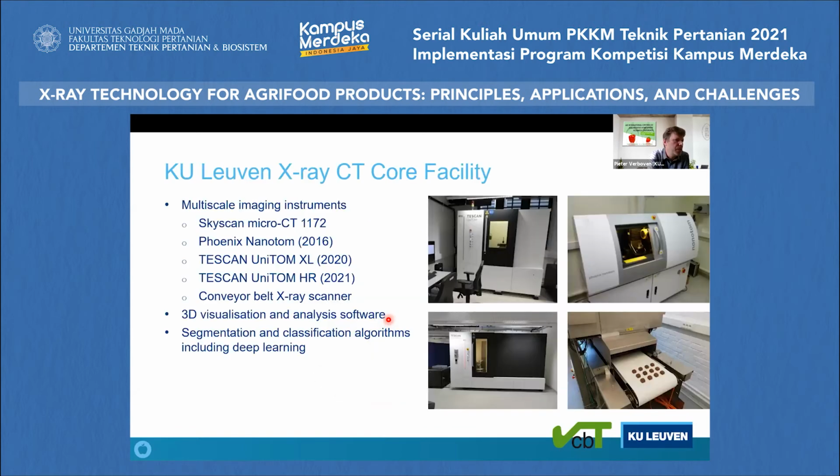Now at KU Leuven, we have invested a lot over the years into X-ray imaging because we see a lot of the benefits here. And because X-ray imaging is used in a lot of disciplines, not only in agri-food applications, together with other groups at the university we have invested into a core facility for X-ray imaging. So we have different instruments at our availability that are listed here. I will not go into the details of those, we don't have time.